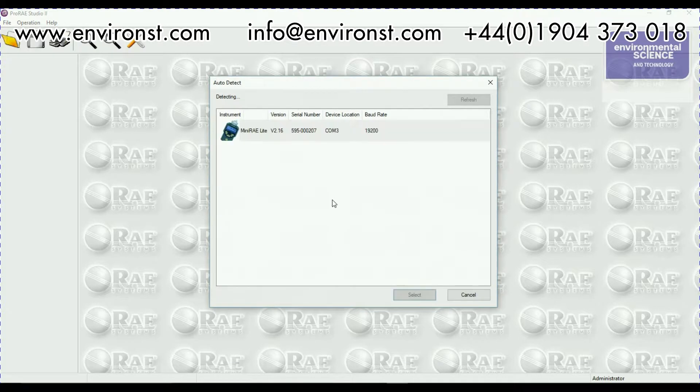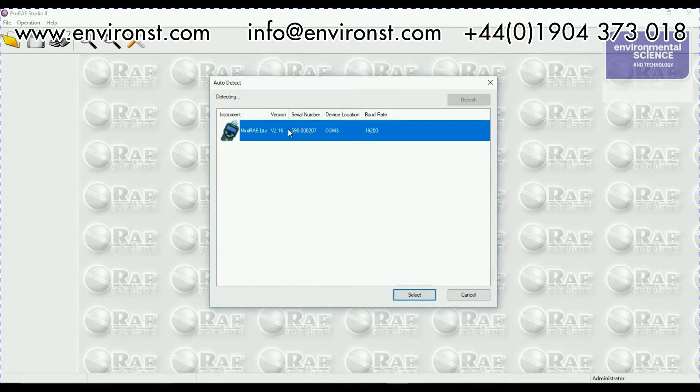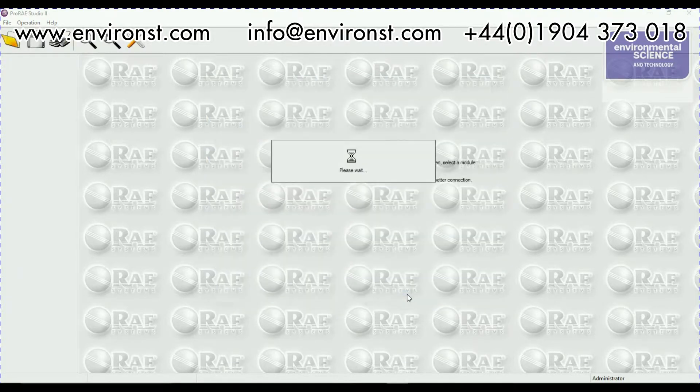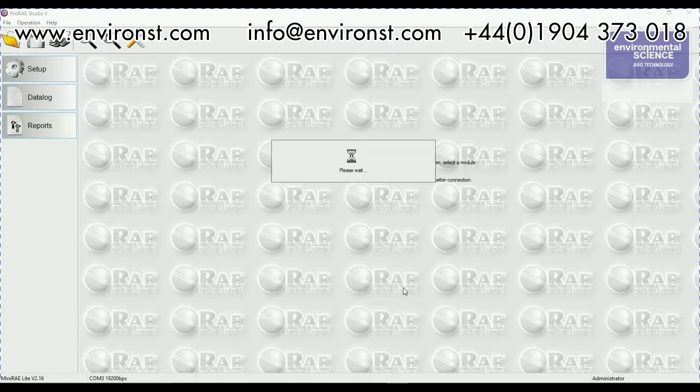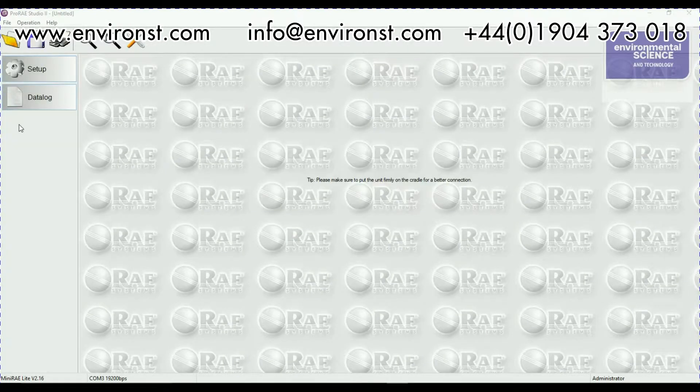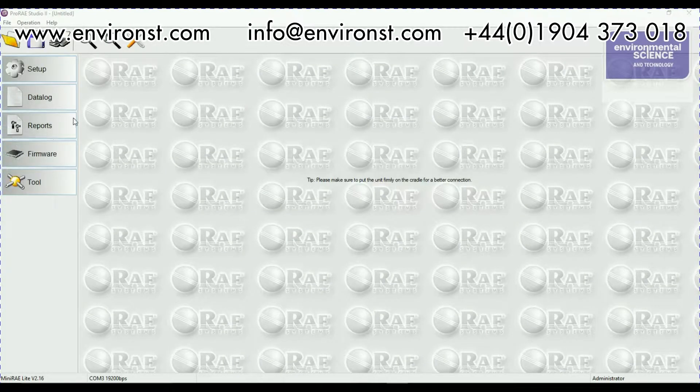So let's just exit that. I go auto detect, go to my mini-ray light, select it and it will load up down the side here.